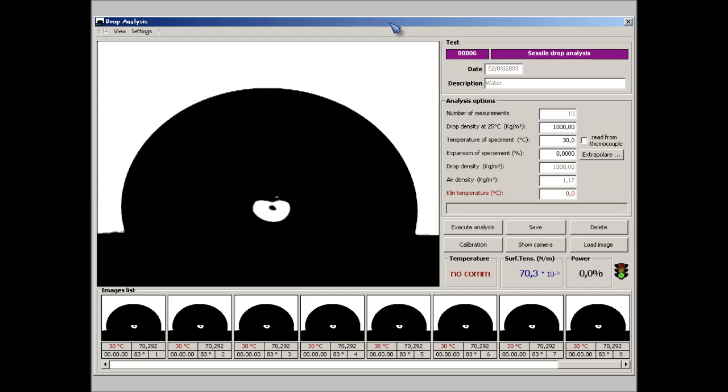The measurement of the surface tension is carried out using the method of the analysis of the sessile drop shape, applying the Young-Laplace formula. A brief description of this method can be found in the product digest or in the presentation of the heating microscope MISURA HSM.